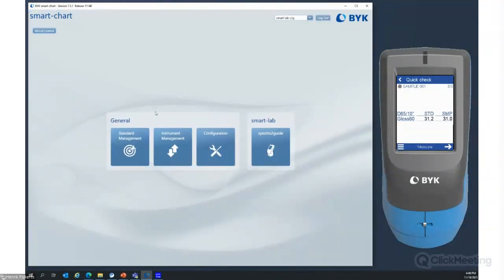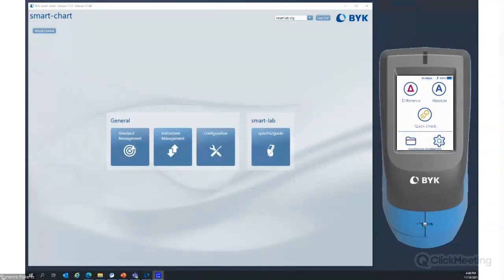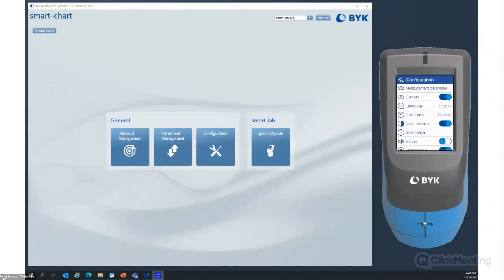So that is designed by our software engineers, that it works like this. So when I go to the virtual instrument, it has configuration and information, and you see this is the IP address of the simulation of an instrument.